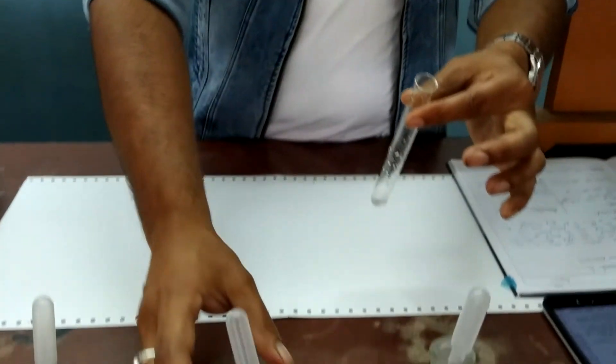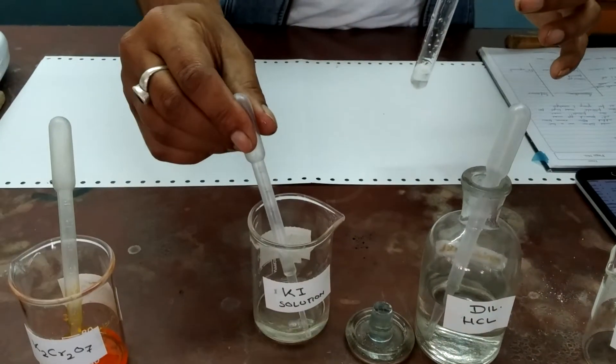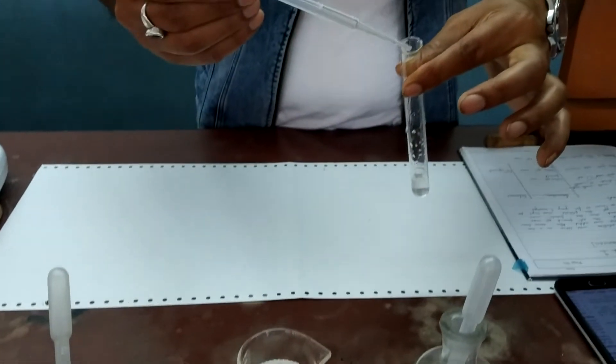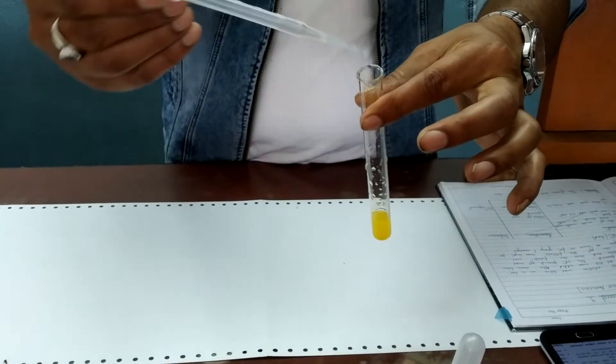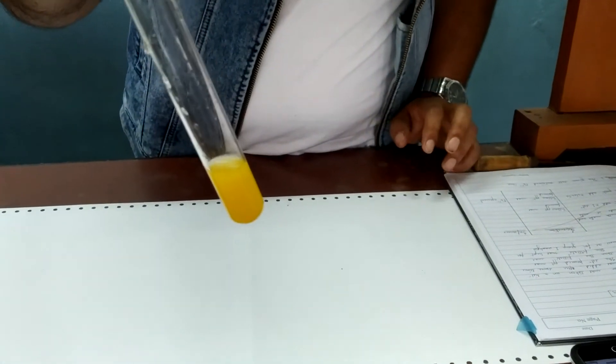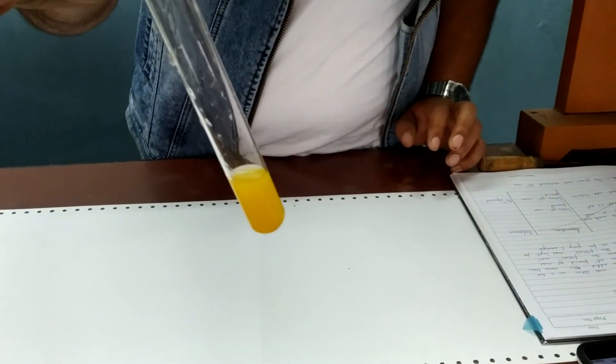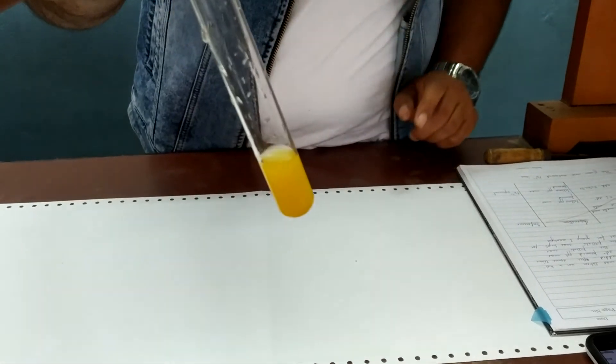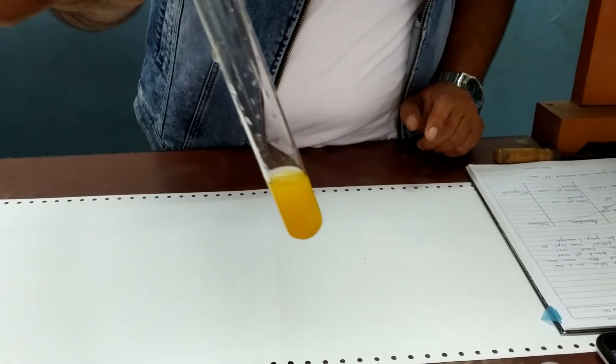In the first part we add potassium iodide solution. As you can see the yellow color PPT is formed. So this confirms the presence of lead in the given sample.